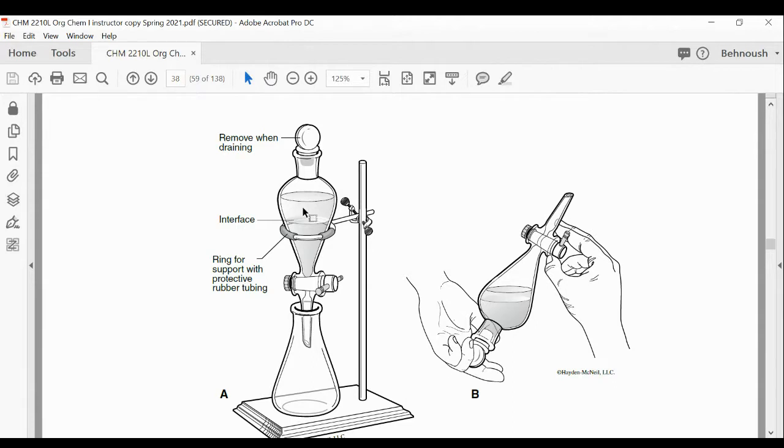And then for another experiment, let's say you have a chemical reaction. I'm going to give you an example of a chemical reaction. Let's say you have benzoic acid and methanol. You mix it. You add sulfuric acid as the catalyst. You're going to have two products. One is methyl benzoate and one is water. We don't need all the mixture together as a product. We only want methyl benzoate as the product.